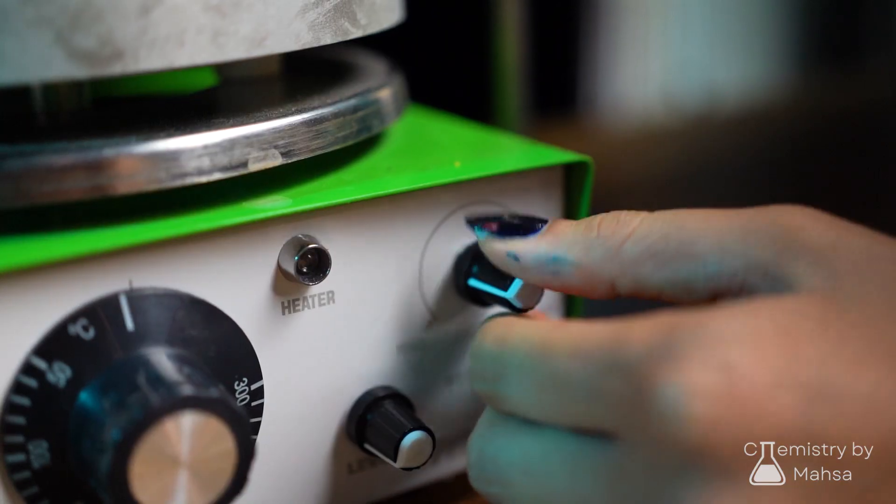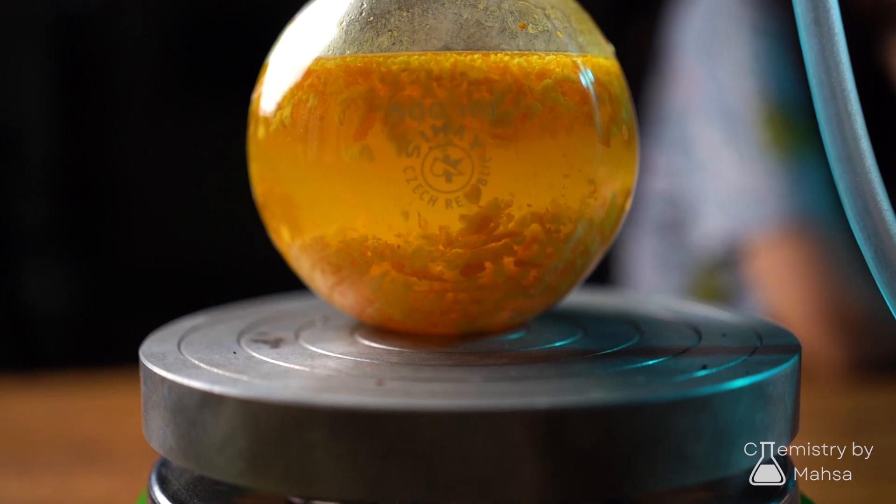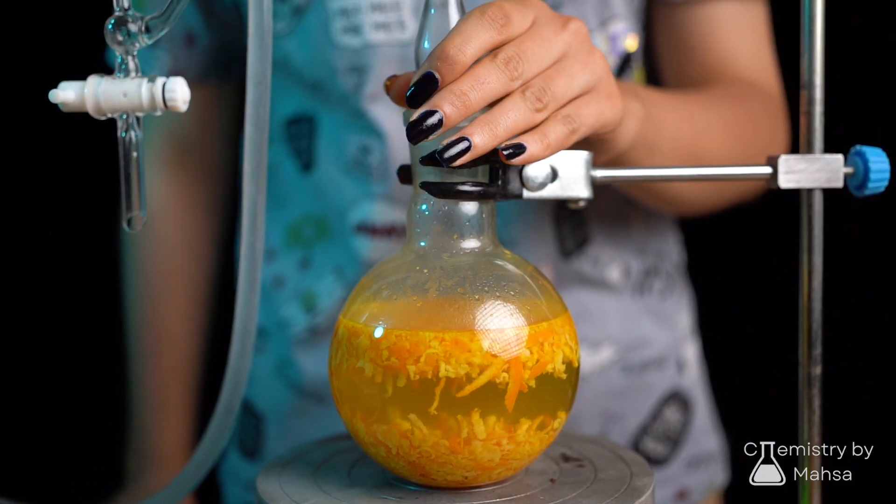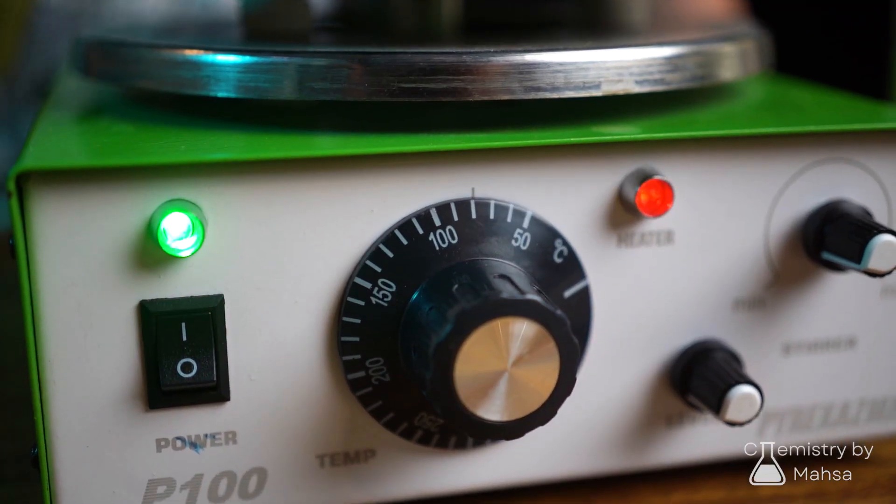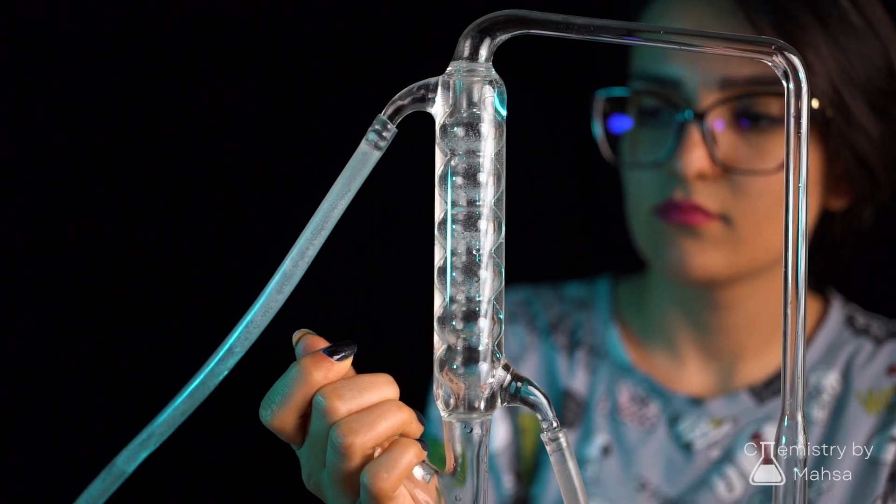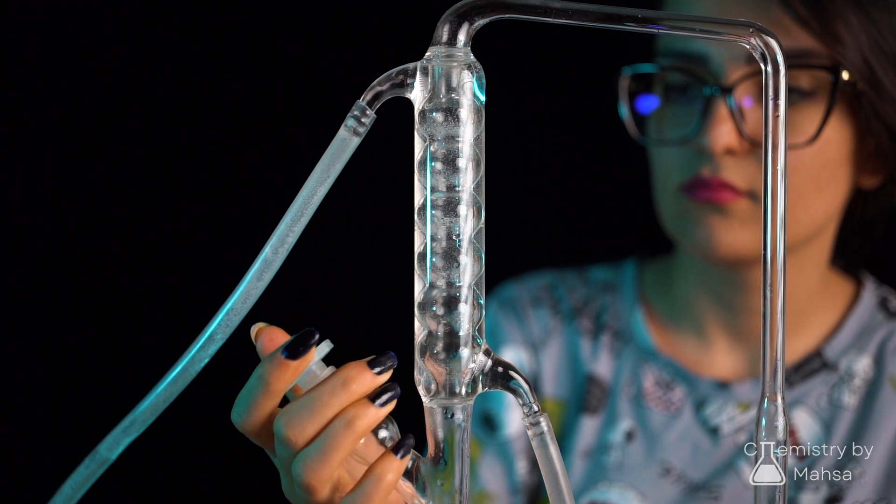So here we go and start the stirrer and the hot plate. The process may take about four hours, and remember not to increase the temperature and just try keeping it around 70 Celsius. Remember, high temperature may have an effect on the final product.